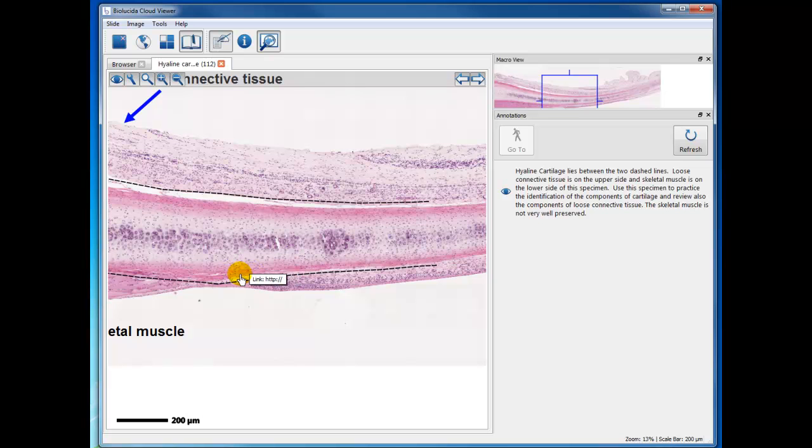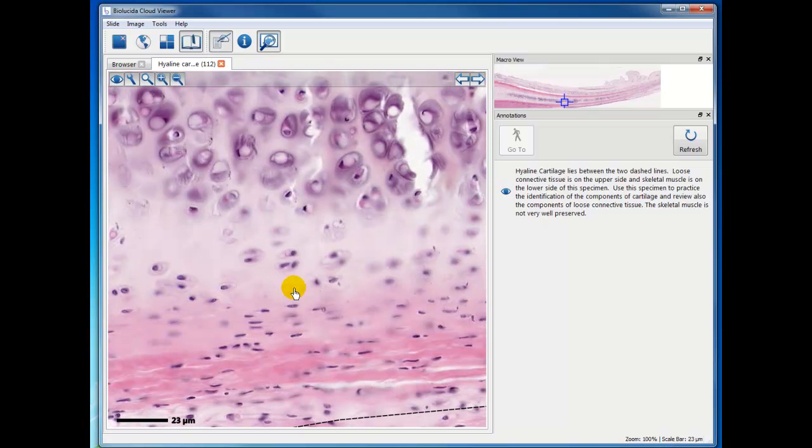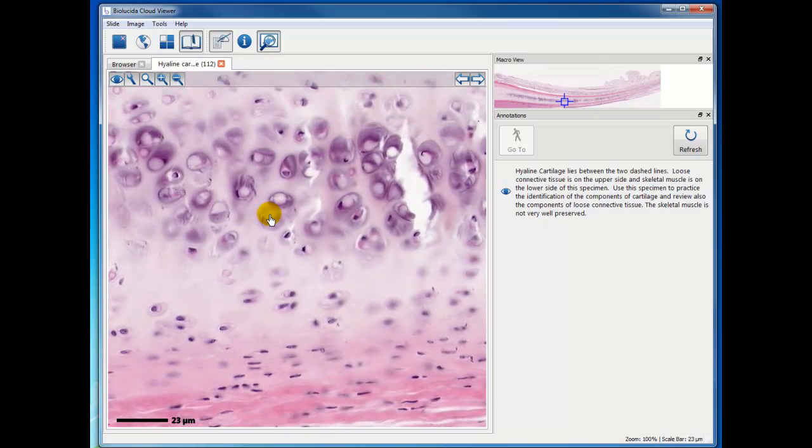reaction is reflecting the concentration of collagen fibers on the edge of the forming cartilage where the chondroblasts are, the perichondrium. And as more and more ground substance is produced, as exhibited here with a lighter area, the collagen fibers are masked. And then finally, in the center, you have a dominance of the ground substance. Remember, hyaline cartilage appears to be glassy. That is, you really don't see the fibers much at all when the cartilage is mature.